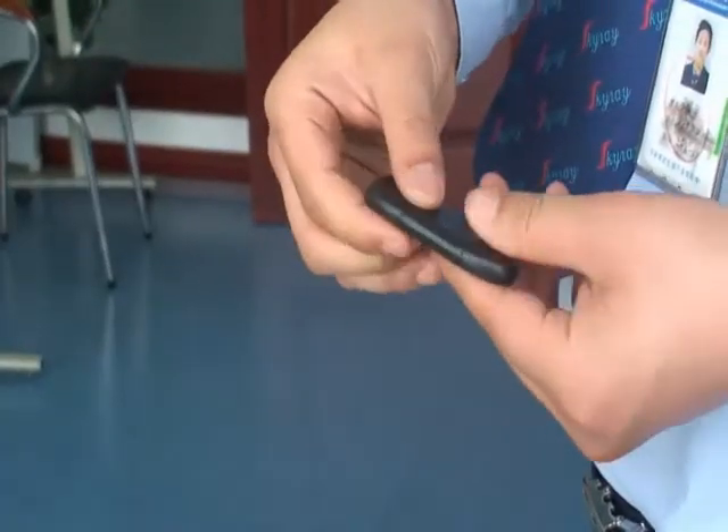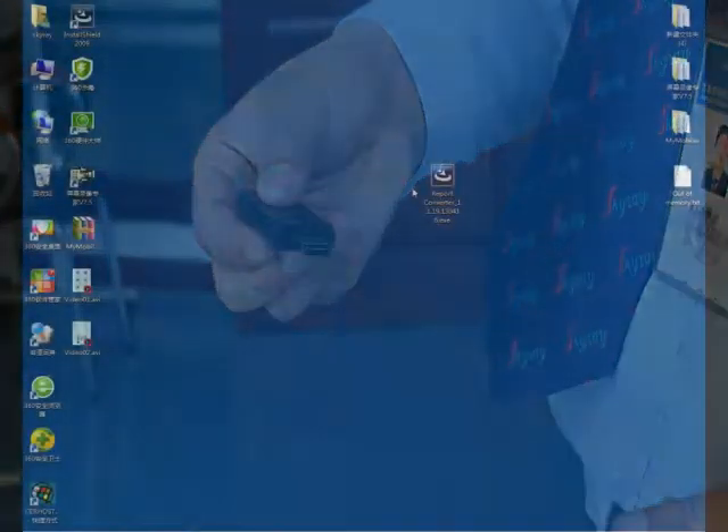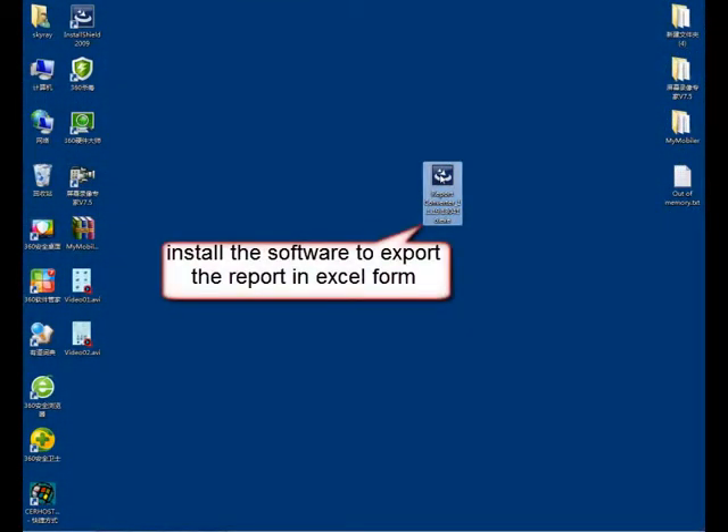Install the Report Converter Software by double-clicking the installation program. Choose your language and click Confirm.